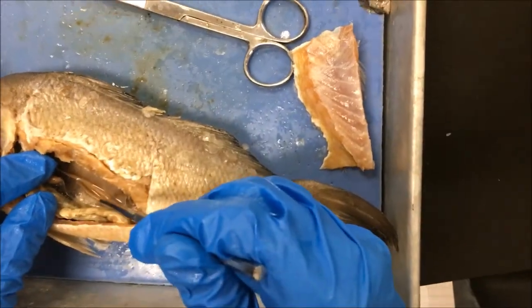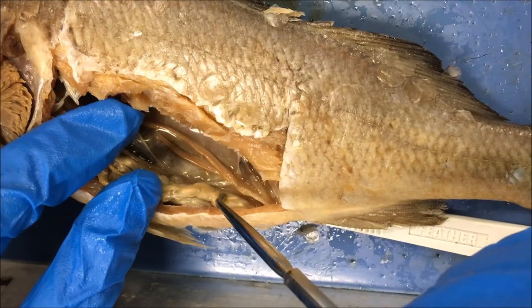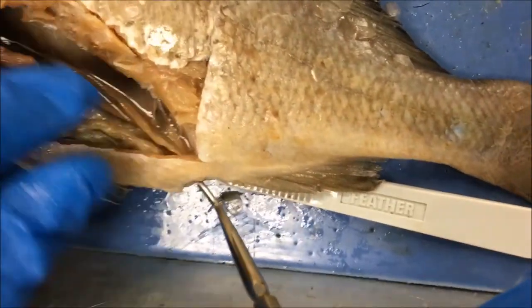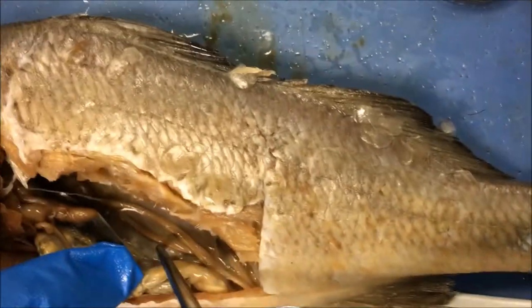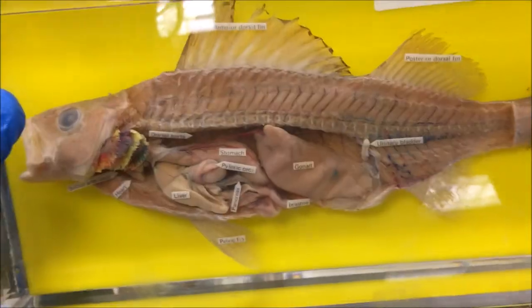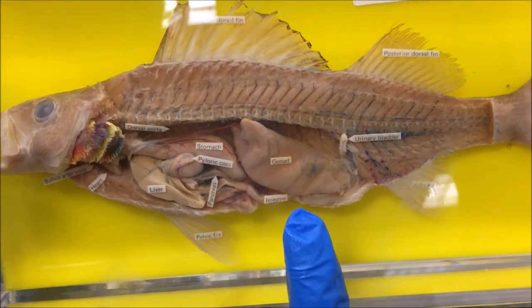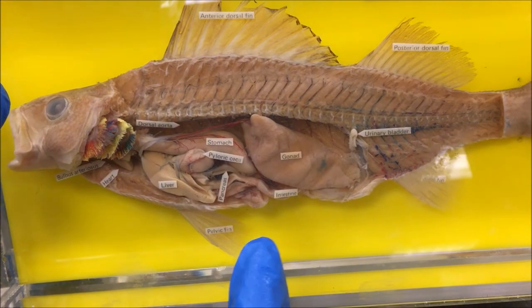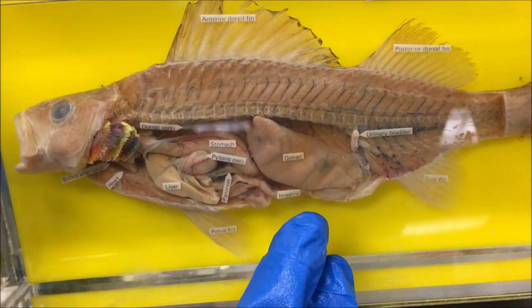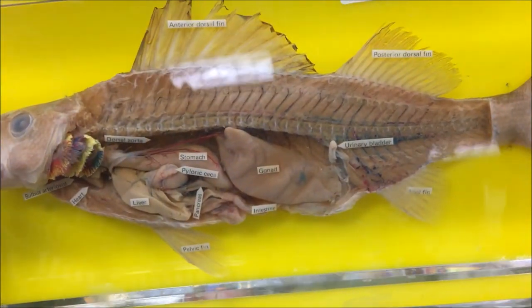These are the gonads of the perch. This one is a male because it has two testes, which produce sperm that would be released through the urogenital opening, where they can externally fertilize eggs from a female. This is a female perch — it has one gonad, the ovary. The ovary produces female gametes, which are ova — eggs — and the eggs are released through the urogenital opening. Perch can lay up to 23,000 eggs.